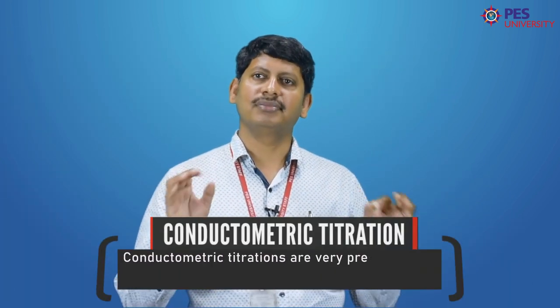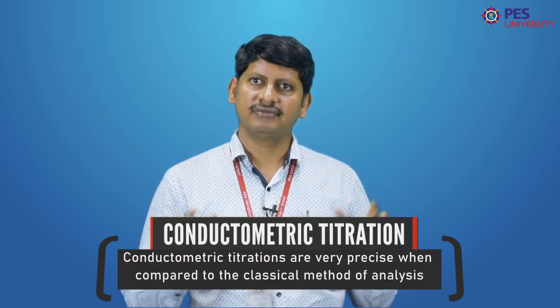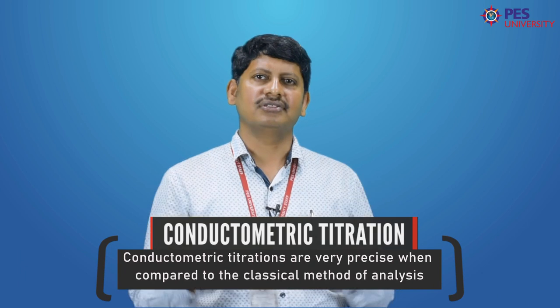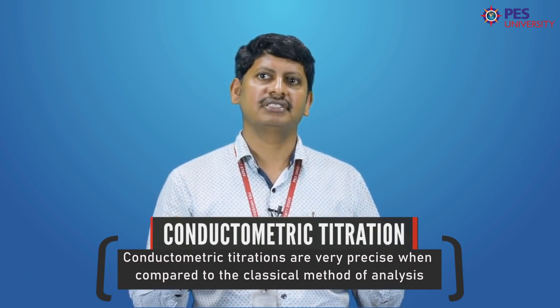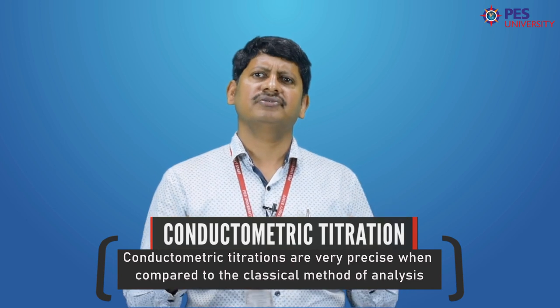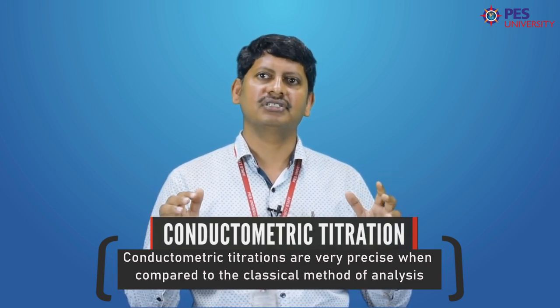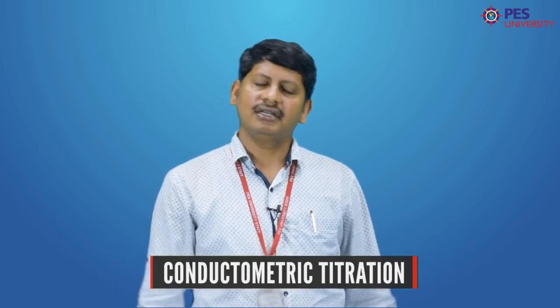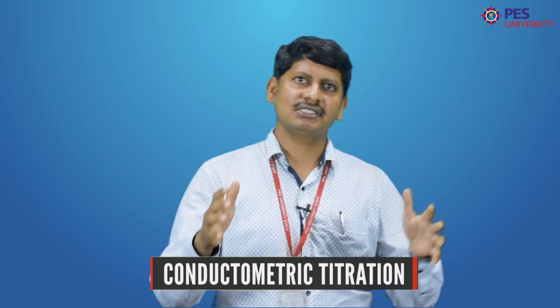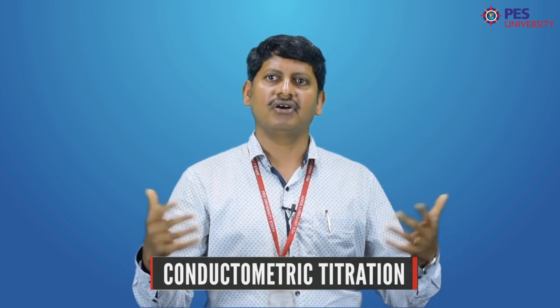easily we can find out cell constant. Conductometric titrations are very precise when compared to the classical method of analysis. Further, in case of dilute solutions and precipitation reactions, the estimation can be carried out with accuracy. The titration of weak acid with a weak base cannot be done by conventional methods, but it can be done conductometrically.